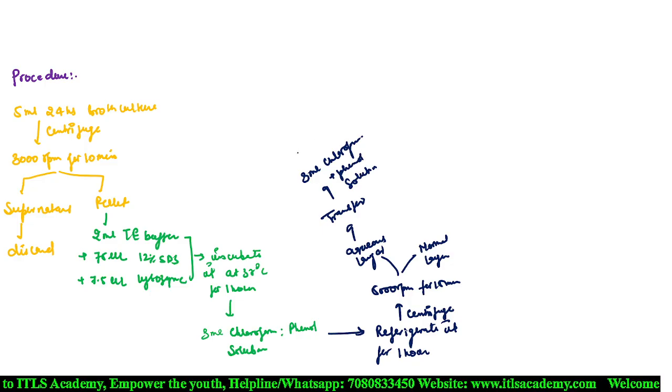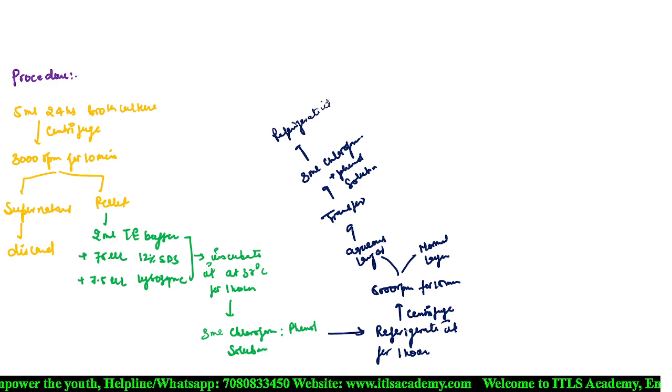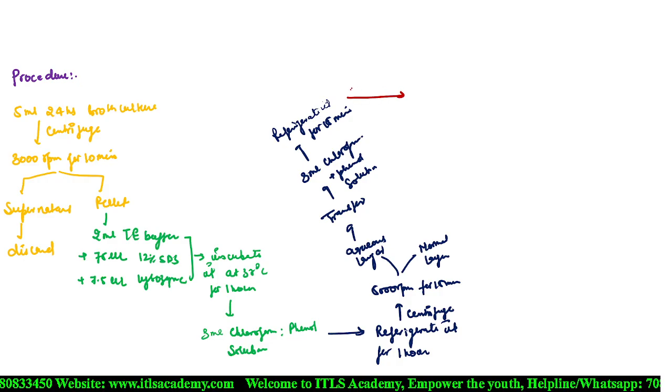Then you have to again refrigerate it for 15 minutes. Then after refrigeration, again you have to centrifuge it.